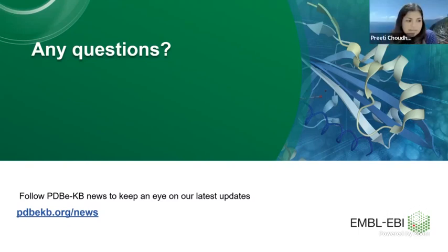Yeah, but you can search with respect to the organism name if that's what you're looking for. So, for example, you can search on the PDBe-KB page, or even using our search page. You can use the taxonomic ID and then look at all the already known PDBe structures, and then look at their amino acids, and from there you can go to similar proteins and look at their amino acid sequences to have an idea of what your protein of interest might look like.